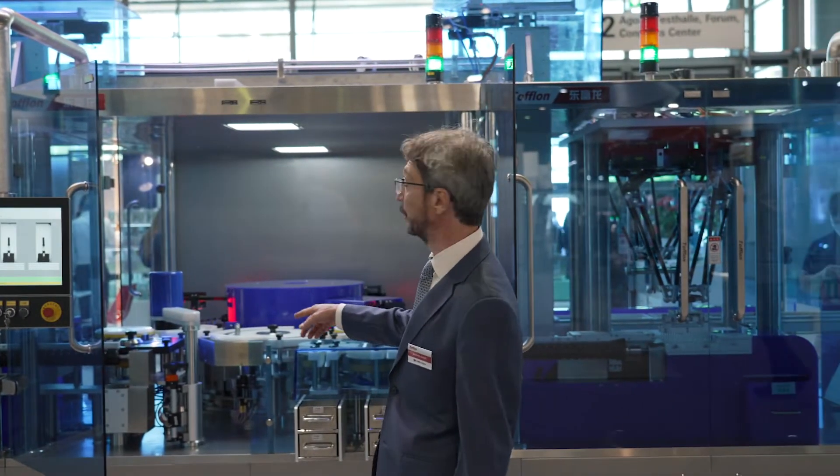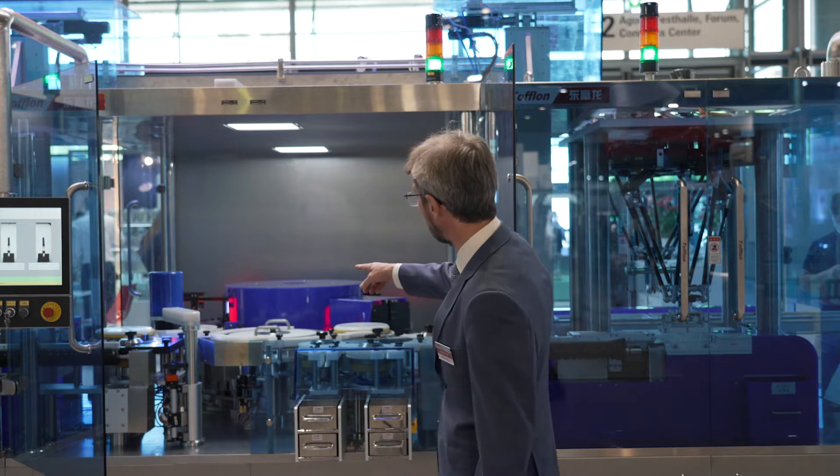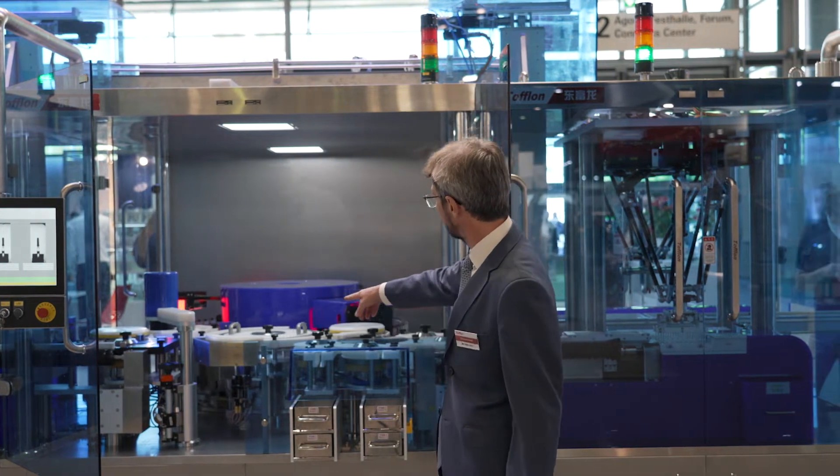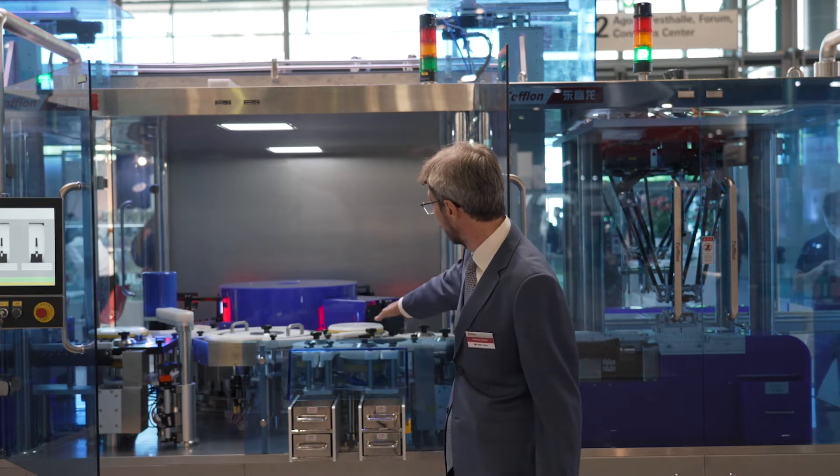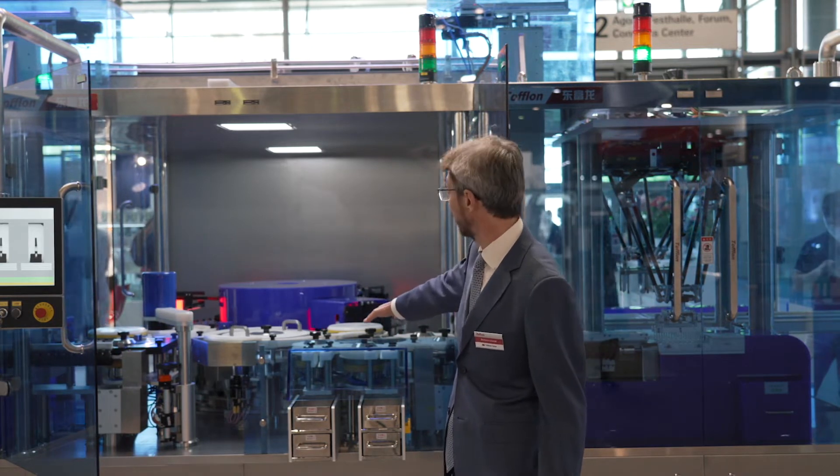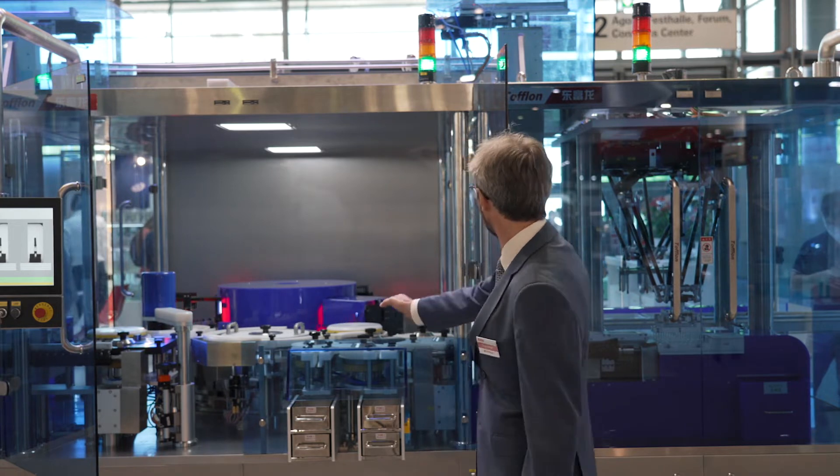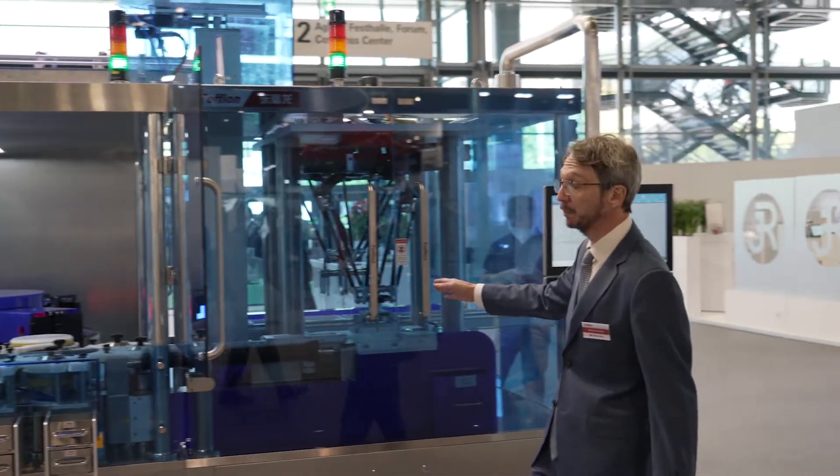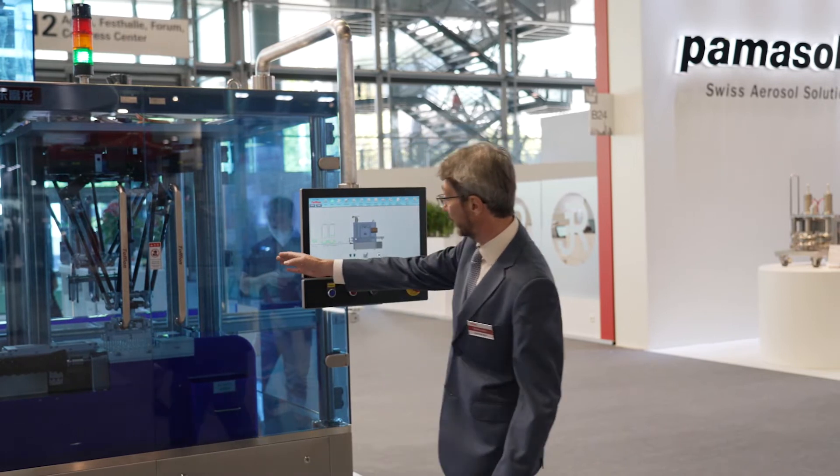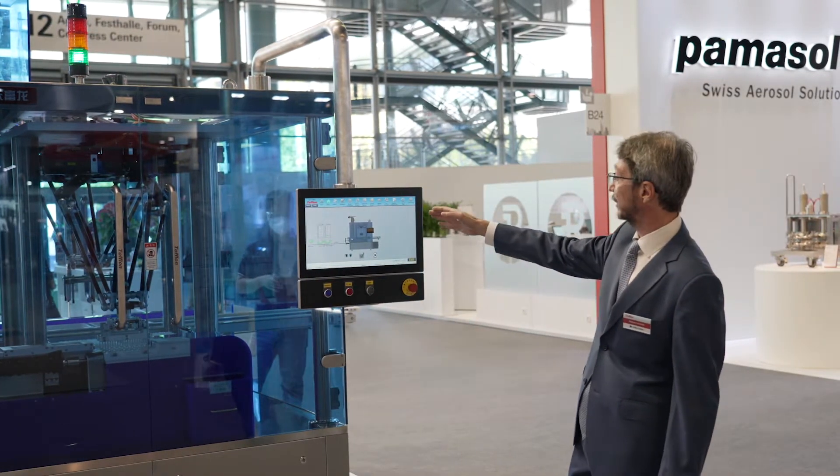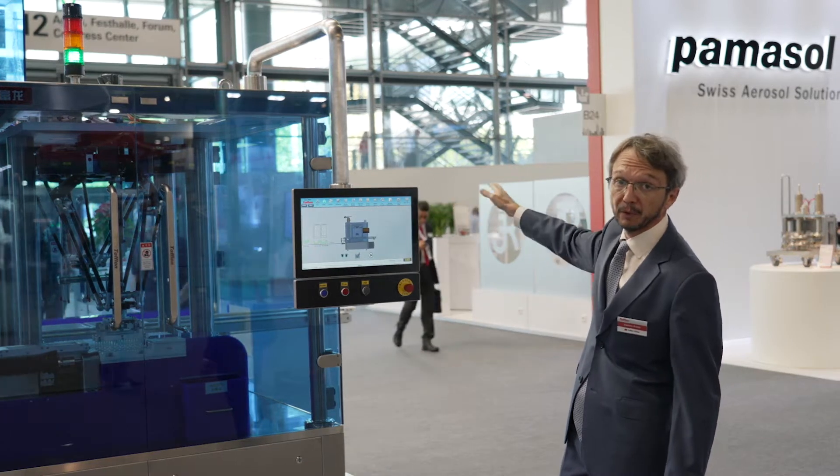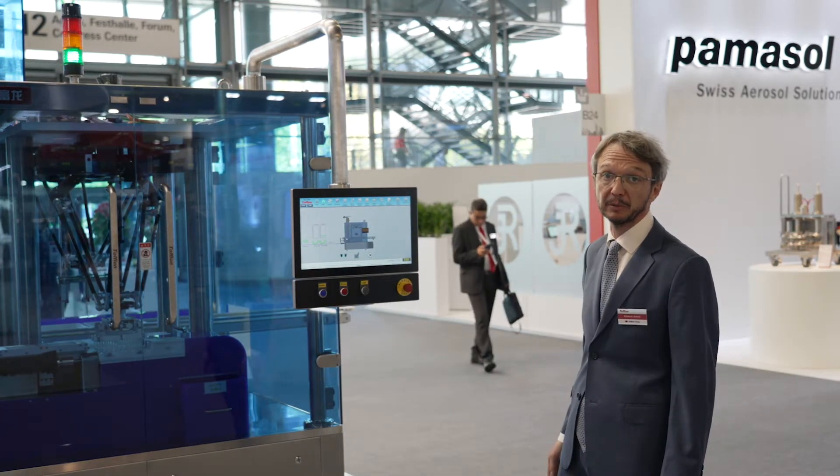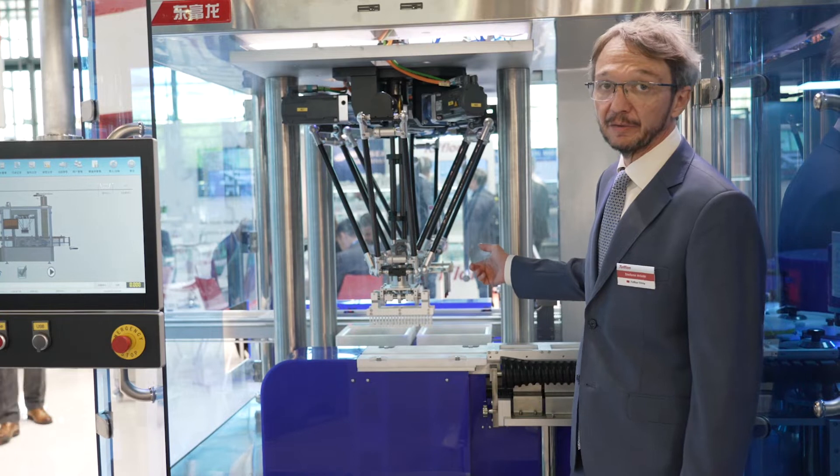After inspection the syringes come to the sorting area where they are separated, the bad containers are separated from the good ones. Finally we have the output area and the re-nesting area where the good syringes are put again in the nest for the next step of manufacturing.